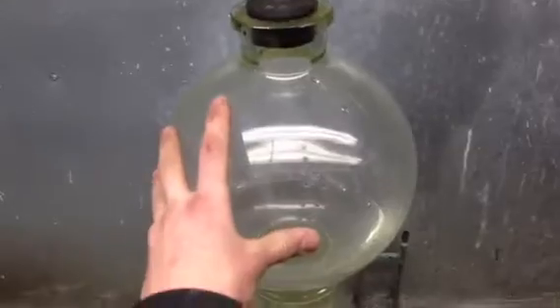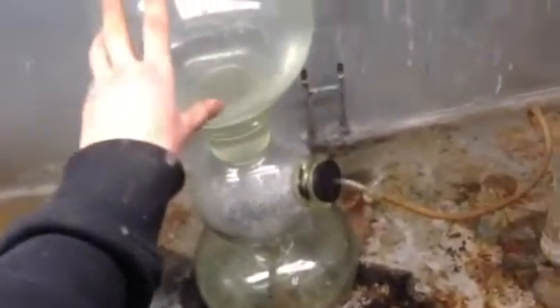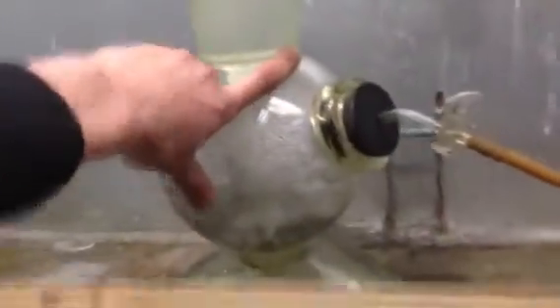Basically you've got a reservoir on top. This is a ridiculously big one too — normally they're a quarter of this size, if that. But anyway, you've got a reservoir on top, a reservoir in the middle, and a reservoir on the bottom. The bottom reservoir is connected to the top via tubes that run right through the middle of the center reservoir.